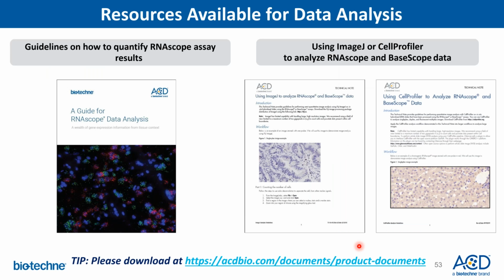We also have resources for data analysis that are available for you. So you can have guidelines on how you can quantify the signal, or how to use ImageJ or CellProfiler. So these are our tech notes for analyzing the RNAscope and BaseScope data. And you can download these resources using the link shown at the bottom of the slide.